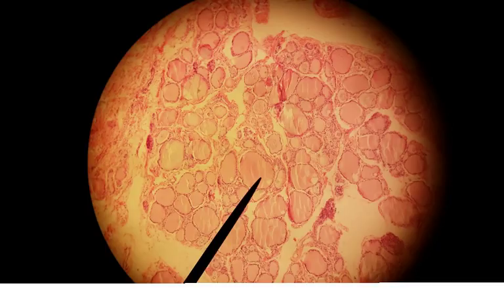Remember calcitonin we talked about a little bit in 137. That's one of those hormones that's involved in calcium maintenance. So on this slide you'll need to know thyroid follicle, the entire structure, the edge is made of simple cuboidal epithelium, the inside is filled with colloid, and then between the thyroid follicles we've got either parafollicular cells or C cells. You'll need to know for the exam what slide this is that you're looking at, each of those structures that we just covered, what hormones are made at each of those regions, and disorders associated with either hypo or hyper secretion by those particular structures.